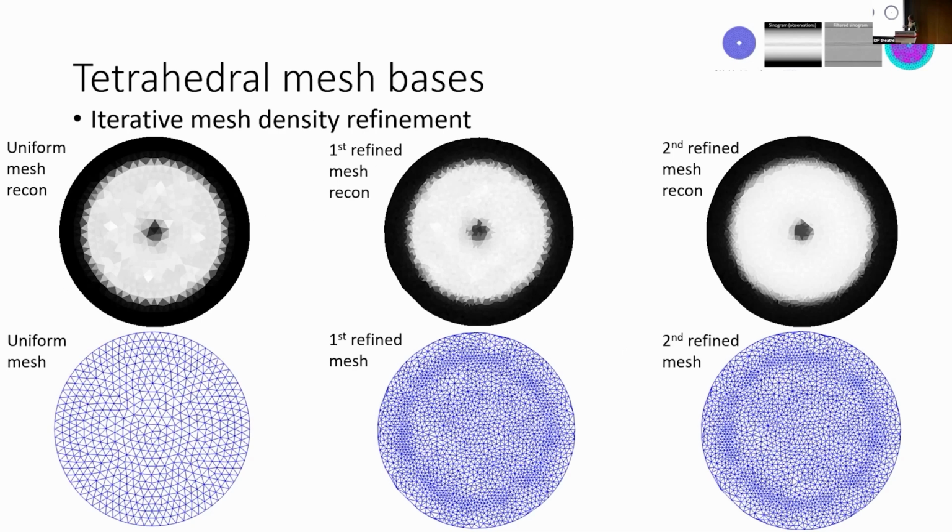So with tetrahedral, the first thing you could do is start with some representation, and then find a refinement of that mesh. You can refine it either by deciding, oh, these tetrahedra I want to break into 3 or 4, so you fix tetrahedra and break them, or you completely remesh everything, so that you have a different density in areas where you need more tetrahedra, where we have edges and things.